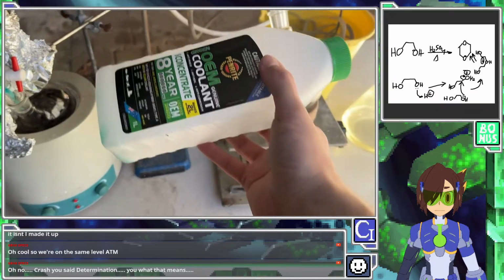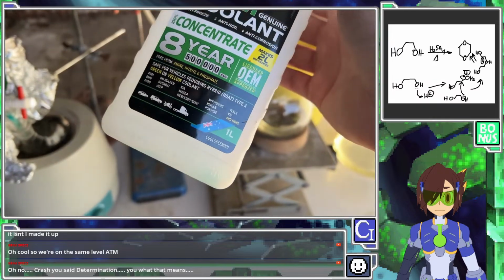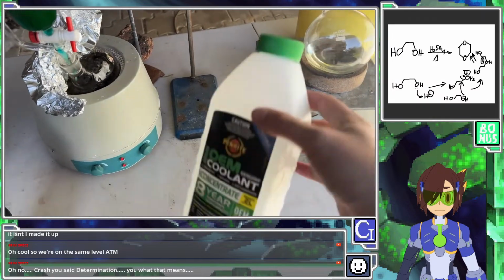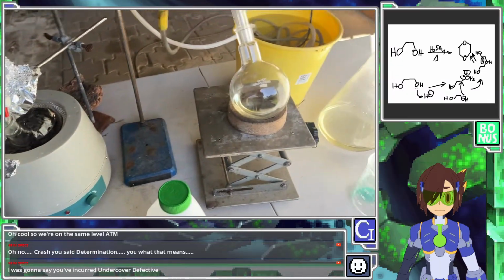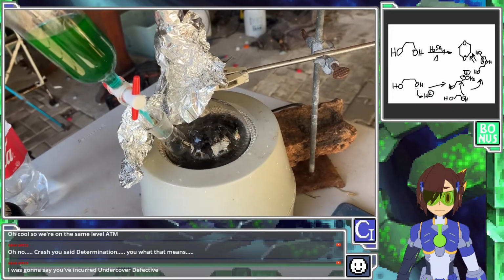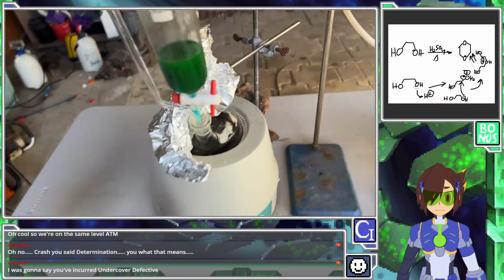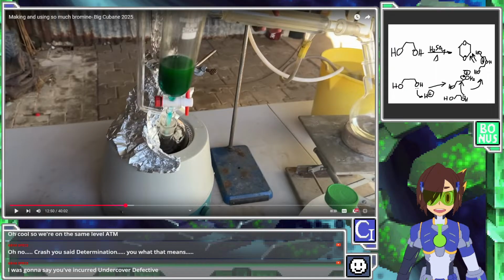On my scales it only weighed out to be 940 grams, which is well short of a litre, but it's probably my scales being out, although that is out by a long way. Anyway, I'm collecting a little bit more piss, still got that to add. It is getting tarry. I caved and added a bit more sulfuric acid. We have the three colors of human fluids: piss on the right, shit in the middle, and then question marks on top.